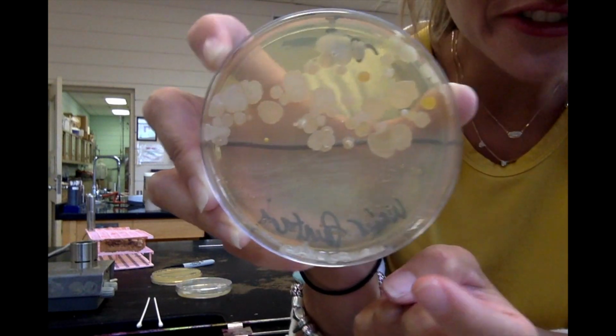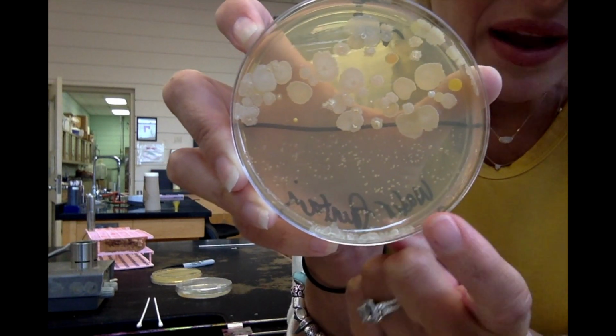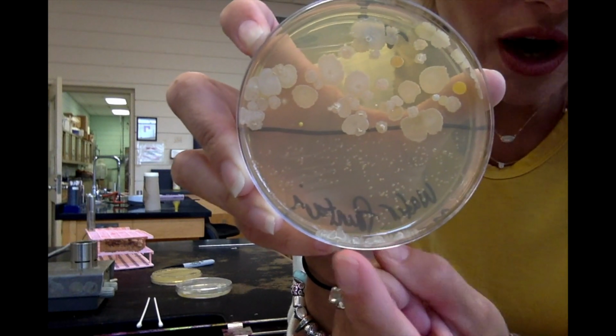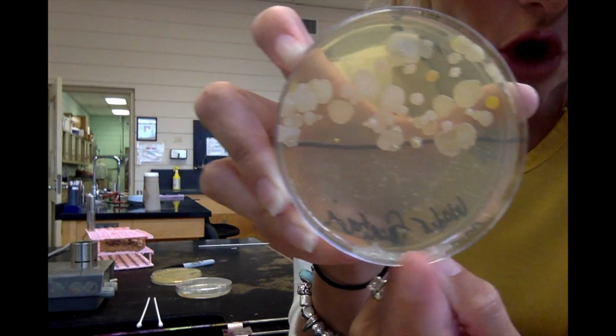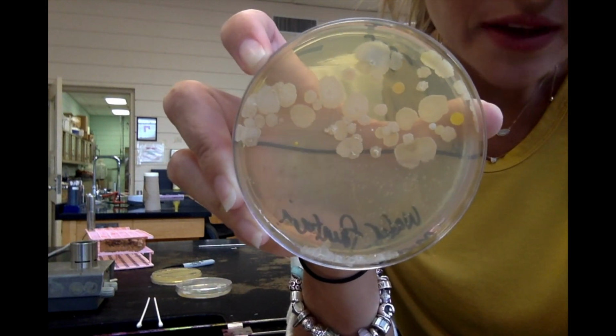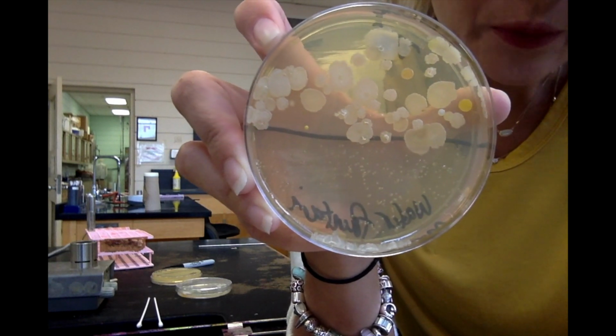Now you see the water fountain, those colonies are relatively small, mainly colorless because they're about the same color as the media, but they're all the same, right? So it's interesting because what's coming out of the water fountain is pretty much all the same bacteria, but what's coming on the bottom of my shoe has all kinds of different kinds of bacteria, okay? And so that's what we want to see for our PCA plate.